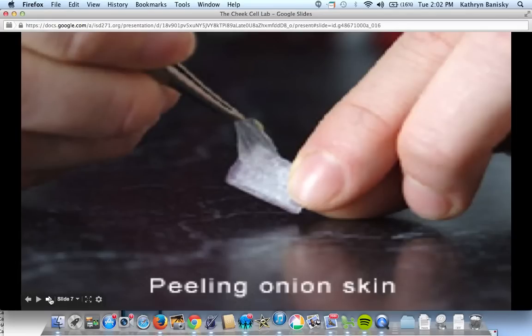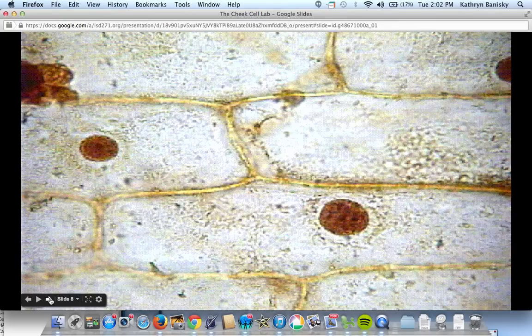You're likely going to be more successful looking at the onion in low and medium power. The onion skin should be almost like saran wrap — that thin. A little water on it will keep it from rolling up. Under the microscope after staining, you should see the cell wall all stained and some nuclei. You won't see everything in a cell — you won't see all the parts you've learned about.